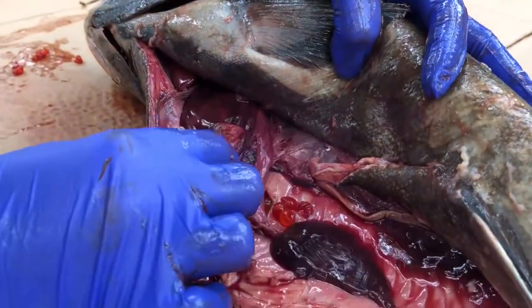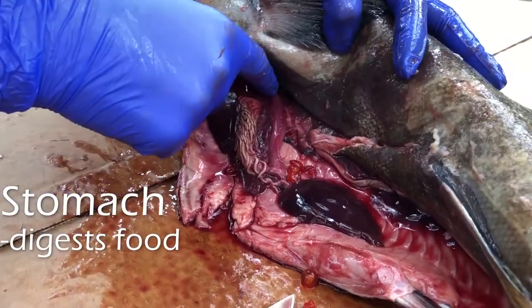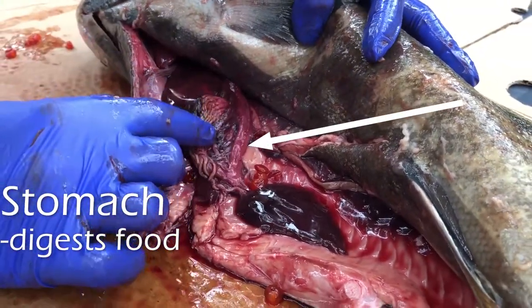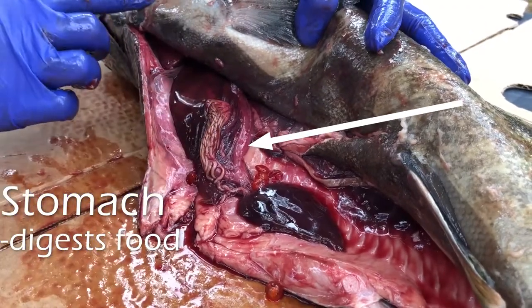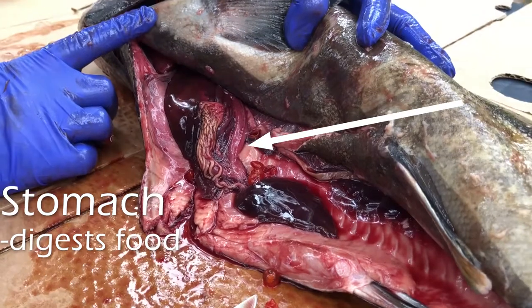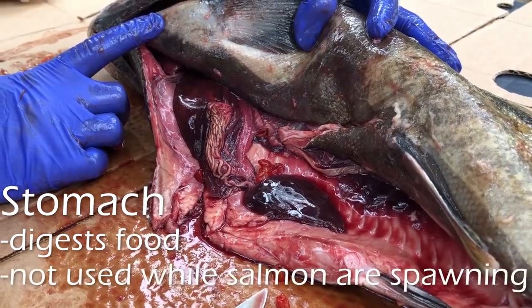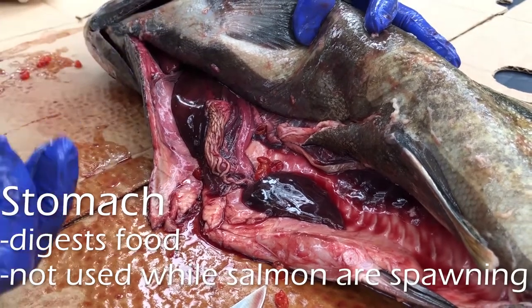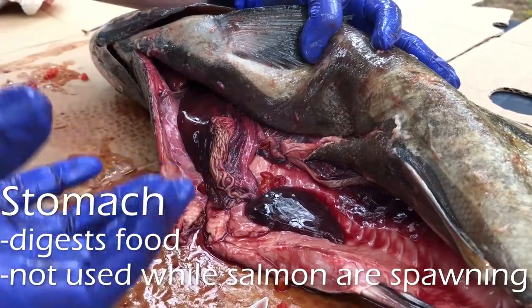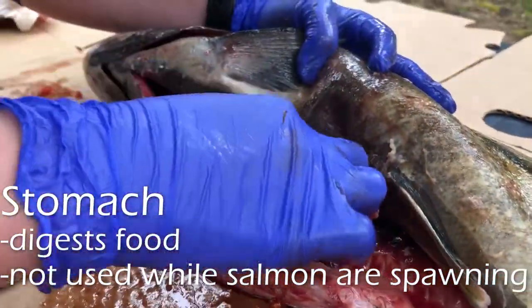This is the rest of the digestive system right here. We have the stomach right here — it's this really small J-shaped organ. The reason it's so small is because this fish died after spawning. In salmon, after they come back from the ocean to spawn, they actually stop eating. The only thing they want to do is reproduce, so they completely stop eating and their stomach will shrivel up like this.